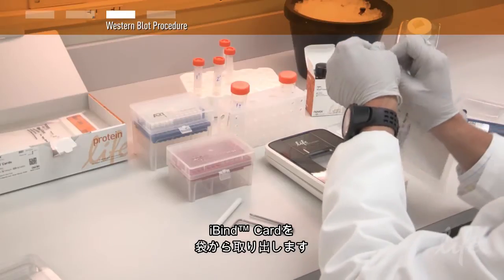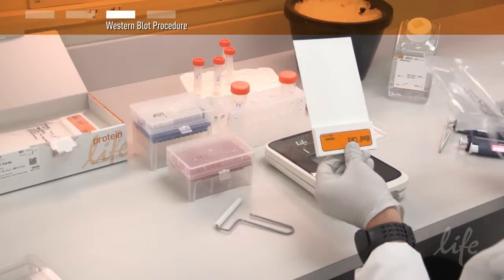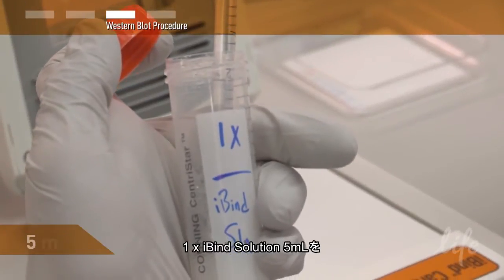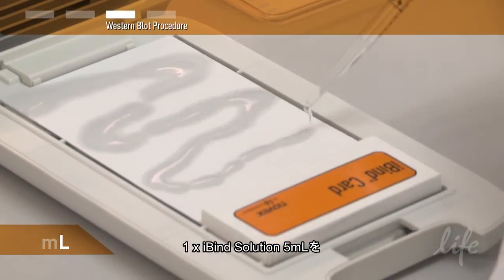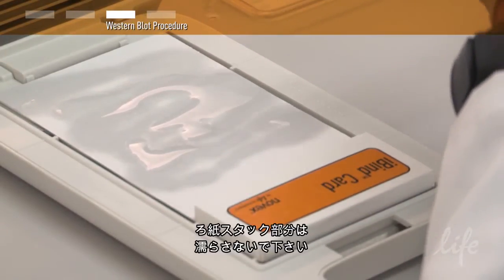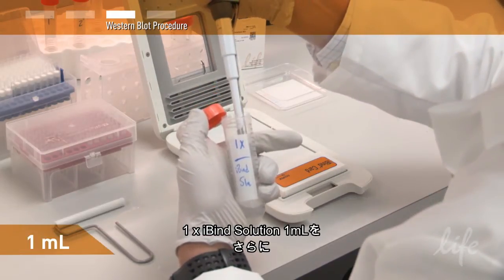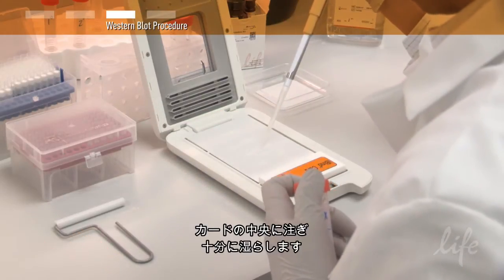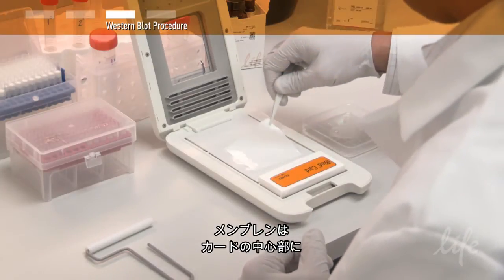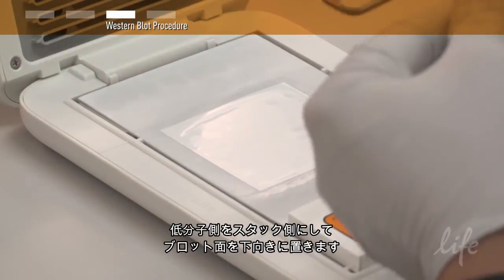Remove the iBind card from the plastic pouch, being careful to only handle it by the absorbent stack. Then place it in the iBind device. Pipet 5 milliliters of the 1X iBind solution evenly across the flow region of the card. Be sure not to wet the stack. Add 1 milliliter of the 1X iBind solution in the middle of the membrane region so that it pools in the center. Place the membrane directly on top of the pooled solution with the protein side down and the low molecular weight proteins closest to the stack.